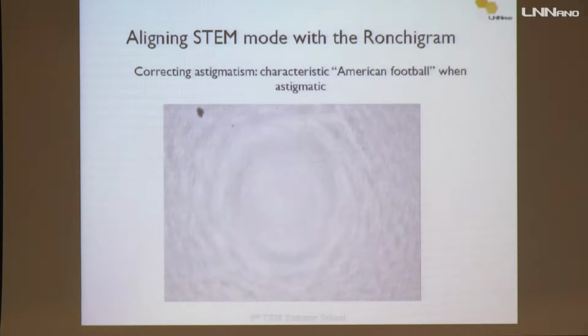We have here now some of the procedures that we need to do to align the STEM mode in the best way, in the excellent way. The first thing that we get is the astigmatism of your probe.